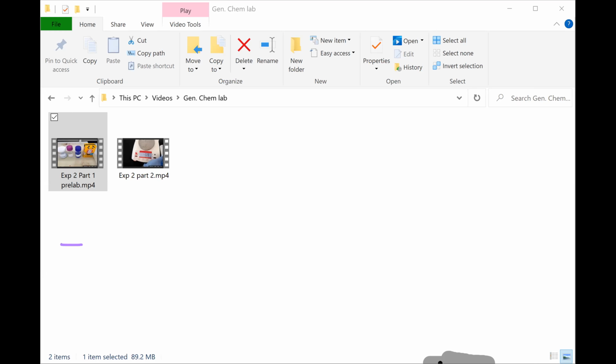We'll be using baking soda, Lysol toilet bowl cleaner, bleach, and another type of toilet bowl cleaner, Vanish. And so all these have certain key ingredients in them that we're going to look at.